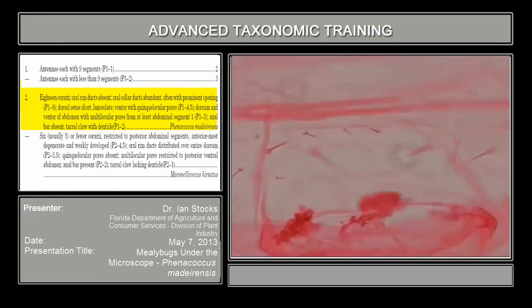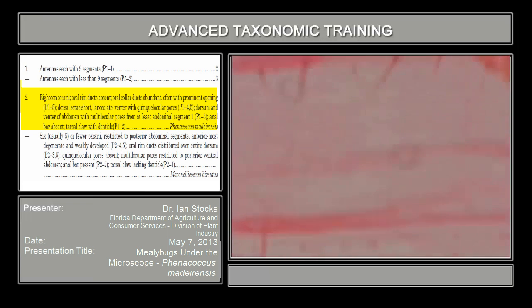It can range from anything that's a small circle to a reasonably large circle to a circle that's been divided in the middle. So actually, the abdominal segmental line will go through it, in which case it's a divided circulus, and that's important at genus and species as well. So there's a significant amount of variability in its shape, and that can all be assessed when running through the key.